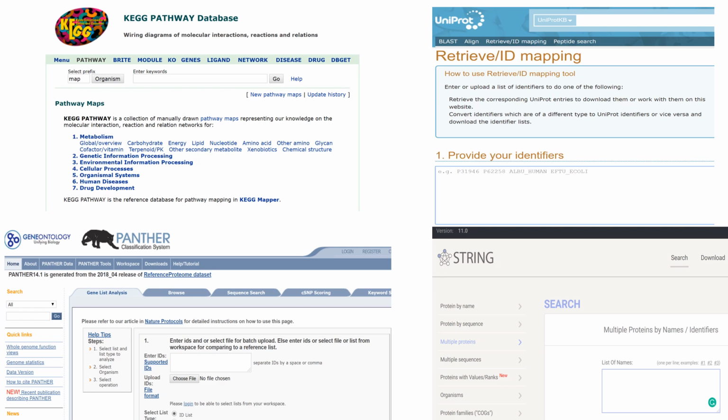Now, once you have that protein and that function, you need to find out what they do in that metabolic process. So you need to find out the pathway. Now you can use STRING or the KEGG database. What STRING does is let you find out which proteins interact with which proteins as well. So you can find a bunch of different proteins that are simultaneously working together for a bunch of different functions. Now STRING is useful when you have huge, massive data sets. Since we don't have that, I opted to use the KEGG pathway database.